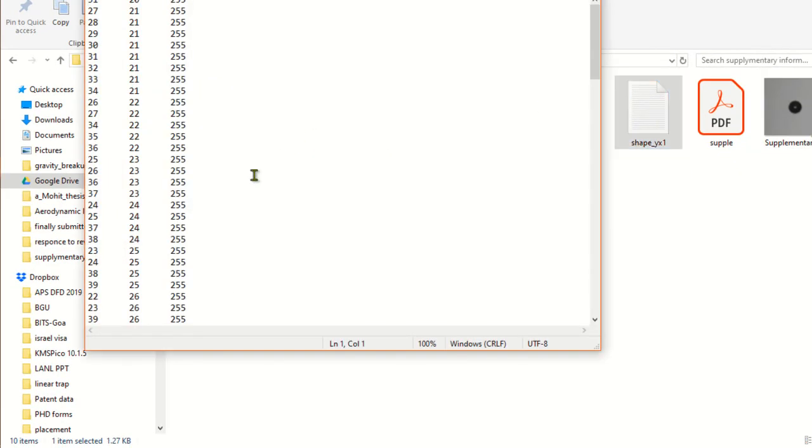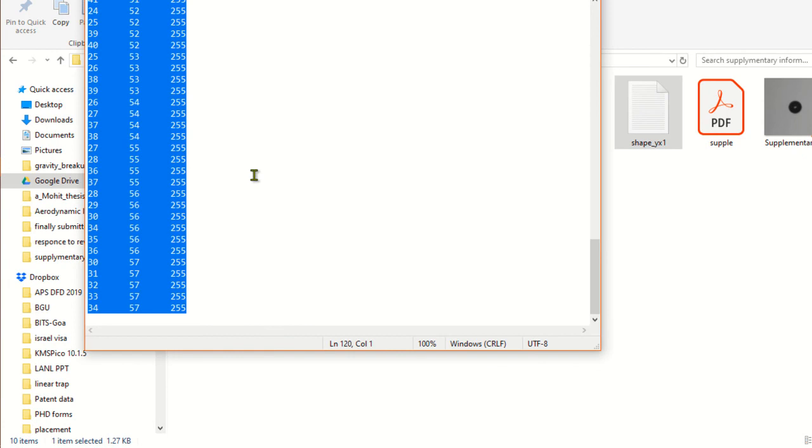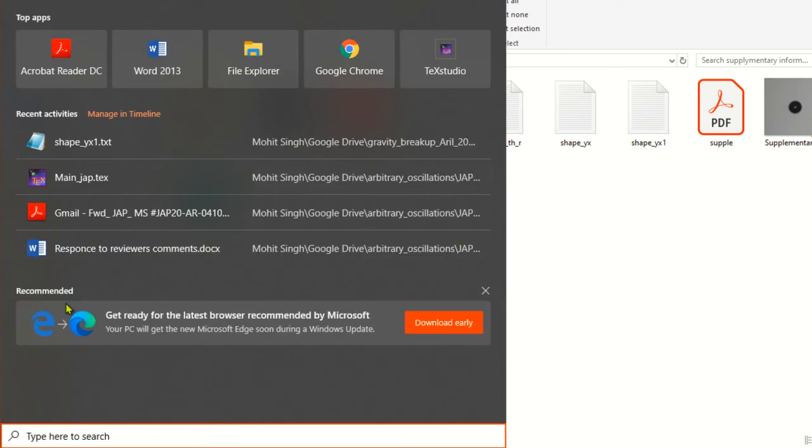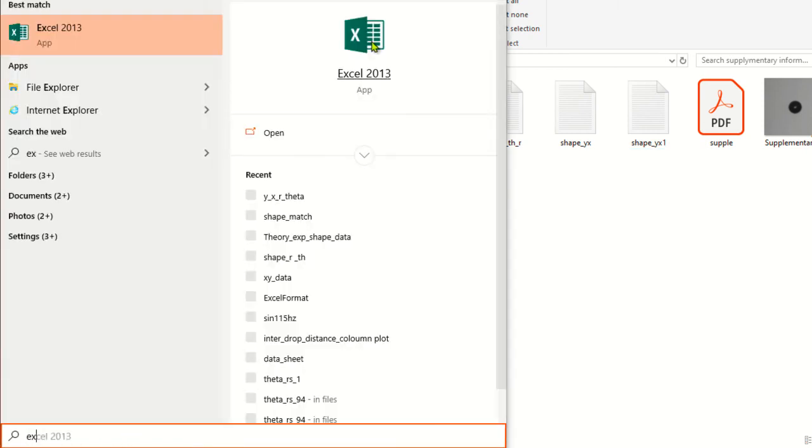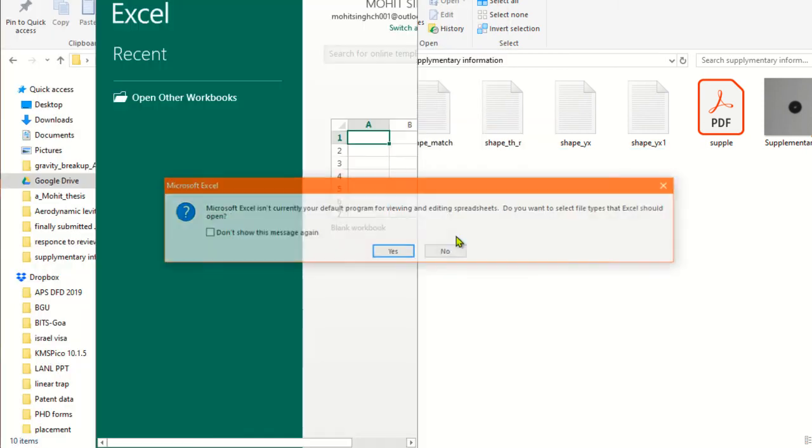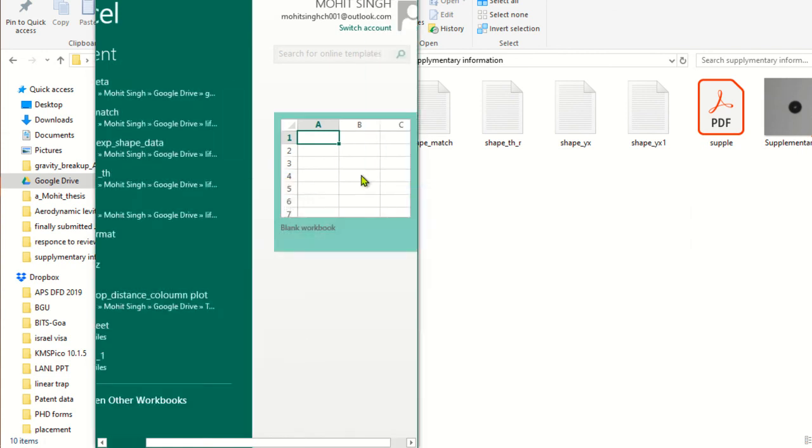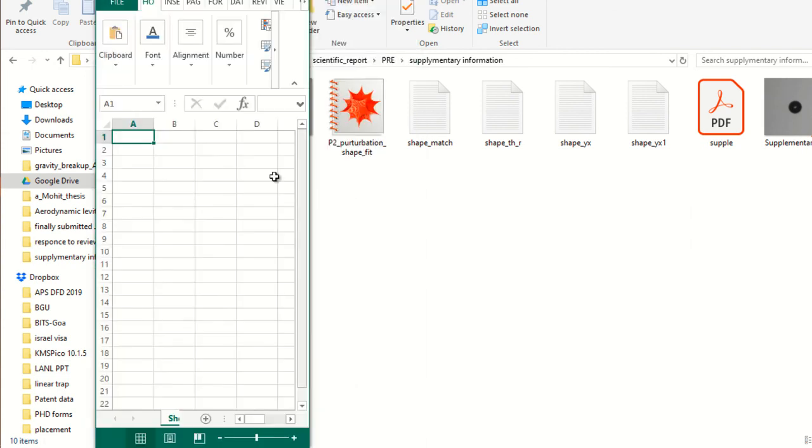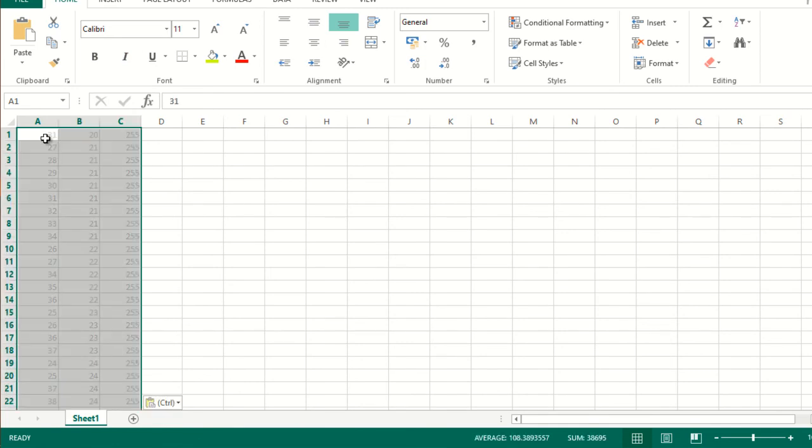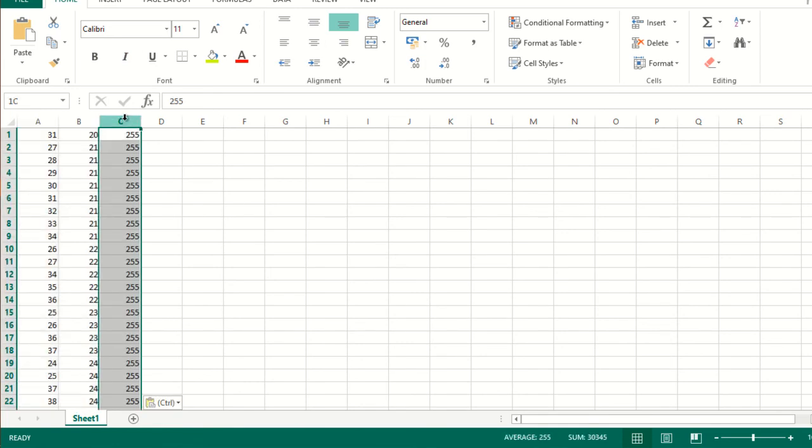Now you can further plot it. For example, just copy, control C, copy it, and open Excel.